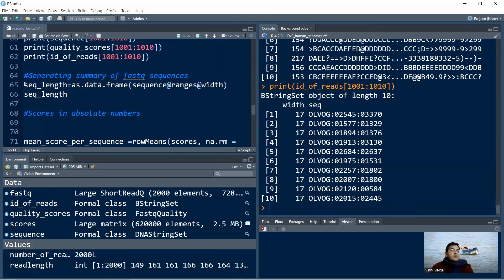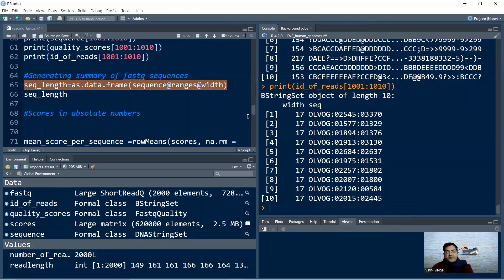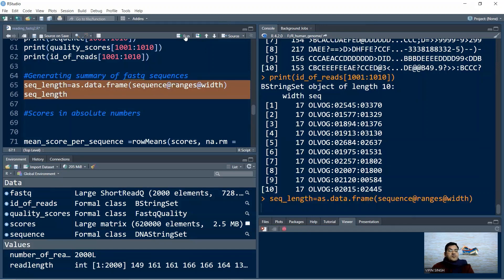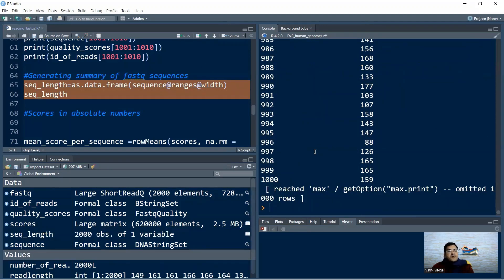Sequence lengths can also be extracted as a data frame. We say sec_length <- as.data.frame(sequence@ranges@width), where width stores the actual sequence lengths. Printing this gives a data frame containing the length information for all sequences.